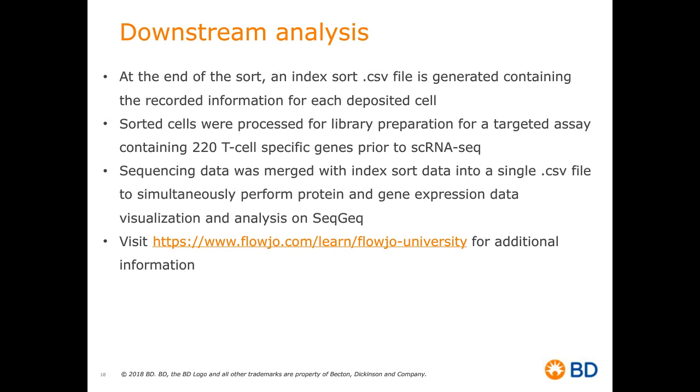And we can have now in a single file all the information that we need to perform simultaneously protein and gene expression analysis. I will not go into the detail on how to perform these steps and how to prepare for the bioinformatics. I will rather focus today on the biology. But I highly encourage you to visit the FlowJo website and the FlowJo University website, where you can find very comprehensive and extensive tutorials that can guide you through this process.